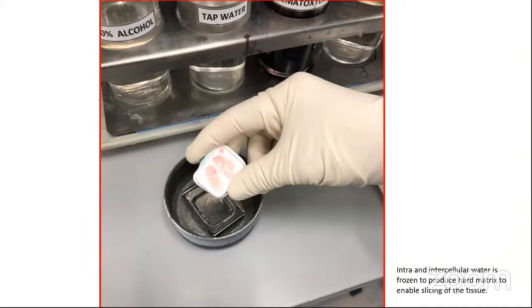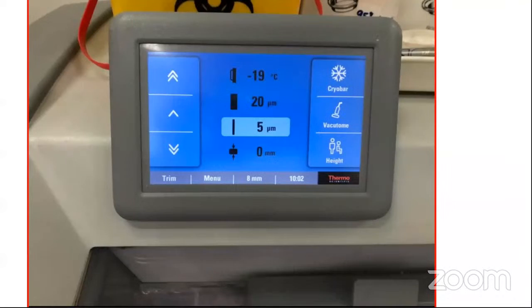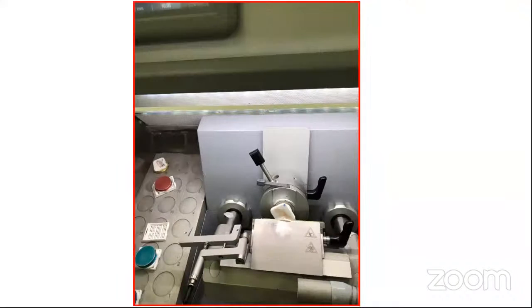This is the intra- and intercellular water freezing to produce a hard matrix, enabling slicing of the tissue. We take this block to a cryostat. This is a cryostat machine. The screen of the cryostat shows that the temperature is minus 19 Celsius, and the thickness of the tissue that we are going to cut is 5 microns. We place the chuck inside the cryostat and start trimming the tissue.